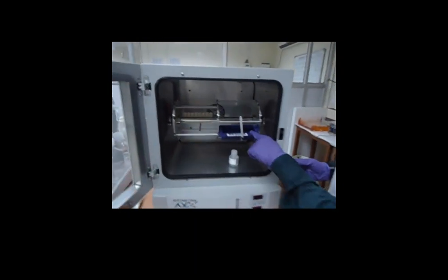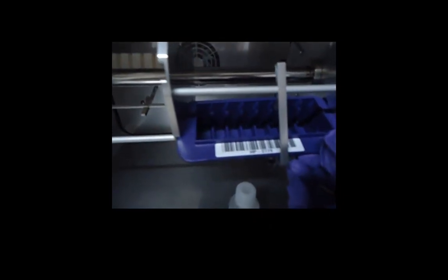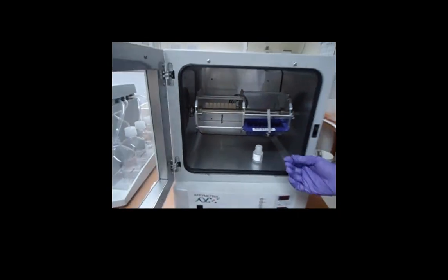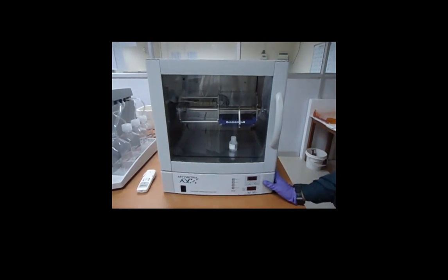Here, this is the position where we can keep the microarray chip. 8 microarray chips can be kept at the same time, and then along with the hybridization buffer we keep the solution inside the chamber, and at a particular time we will allow it to run.